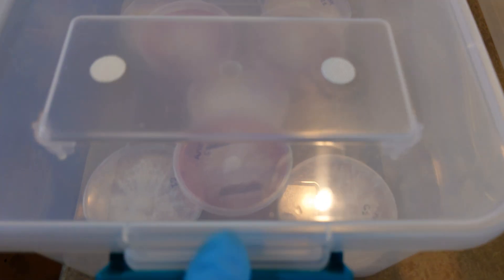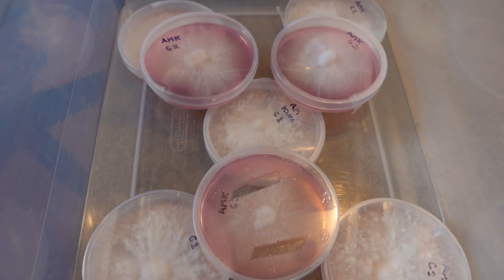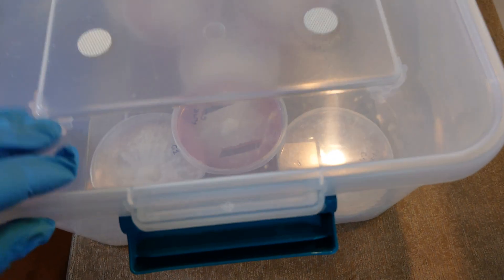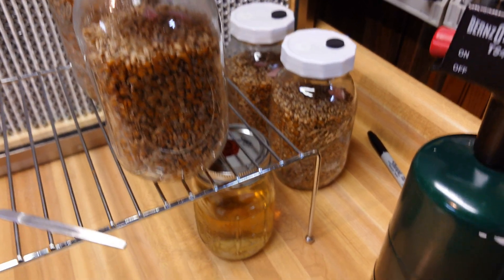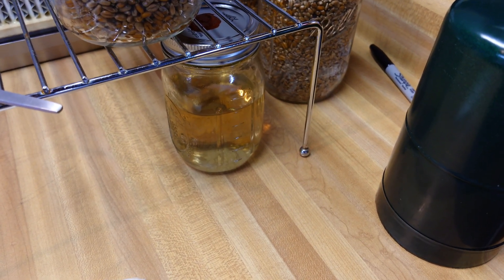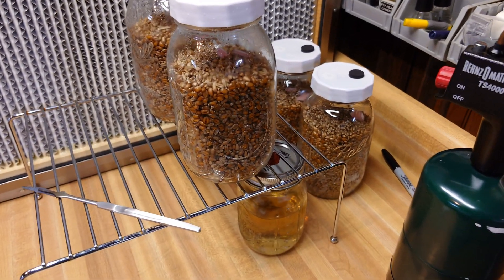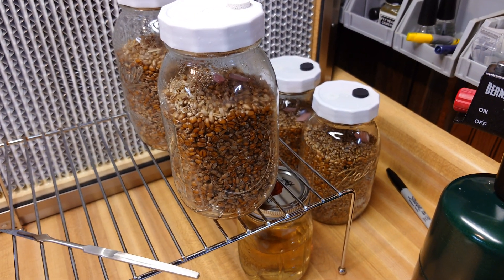Our second-gen plates turned out beautiful as well — I actually don't have any contamination on any of our plates. So we just did some transfers to grain. Cut some wedges out and now we have four grain jars inoculated. I also dropped some into some freshly sterilized liquid culture nutrient broth. So far it's been pretty aggressive on agar, so I imagine it's going to be pretty aggressive in the LC and grain as well. We'll let it colonize and jump back in.